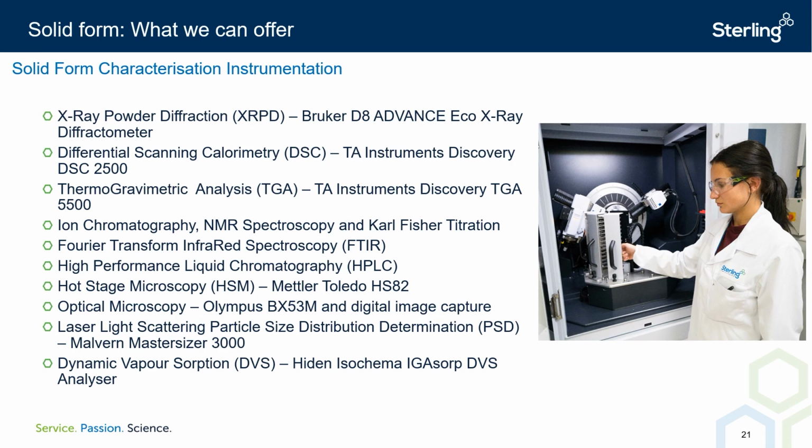X-ray powder diffraction is the main workhorse in rapid API version determination, generating an X-ray diffraction pattern that is unique to each API version, though it should be stressed that XRPD data alone is not enough to identify the nature of a sample, only to confirm that the crystal lattice either matches existing references or affords a different diffraction pattern.